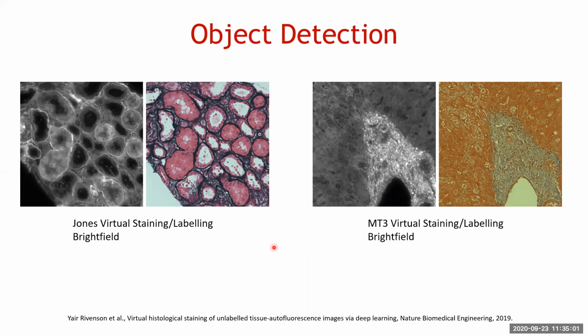So I did mention this could lead the way towards reducing sample prep time. Not just sample prep, but every time you stain and treat your sample, you end up putting it through a bunch of dehydration steps and whatnot, and the tissue is not the same at that point. So being able to do this could mean that you get to see your tissue in a more realistic standpoint.